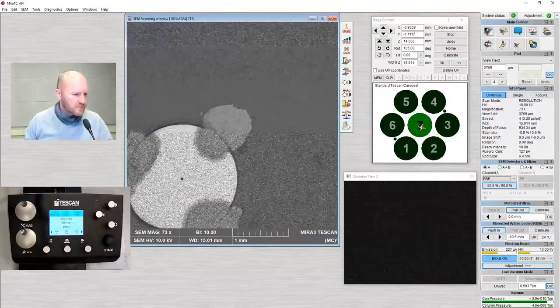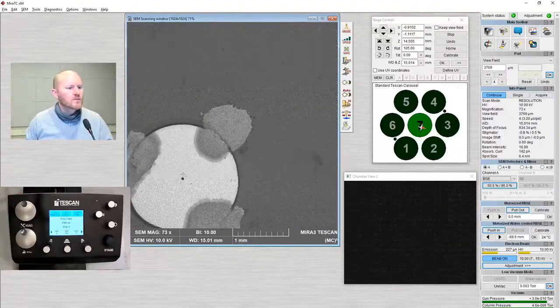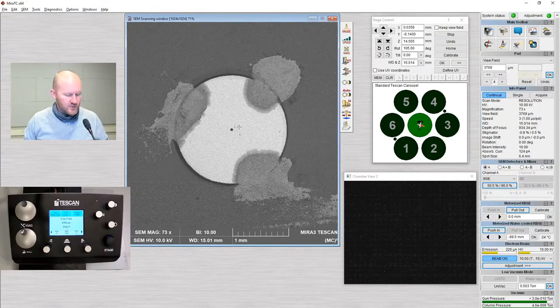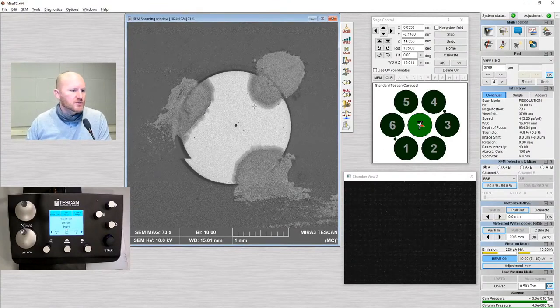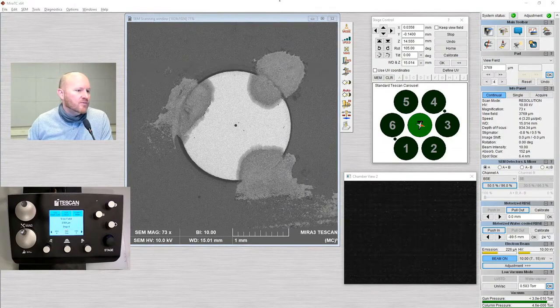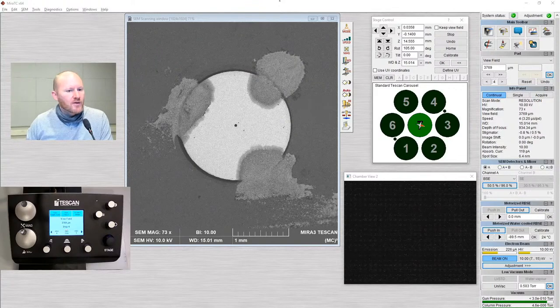I can also do X-ray maps to look at the spatial distribution. I'm actually not going to do that today. If you have interest in collecting spectral maps, line profiles, or doing quantification, that's something we'll talk about offline.